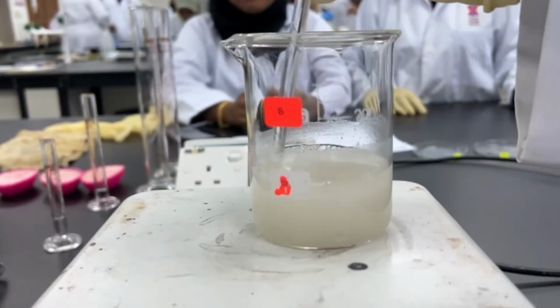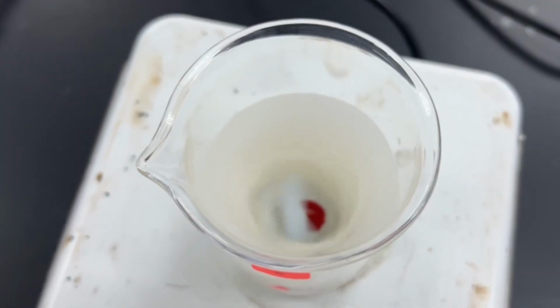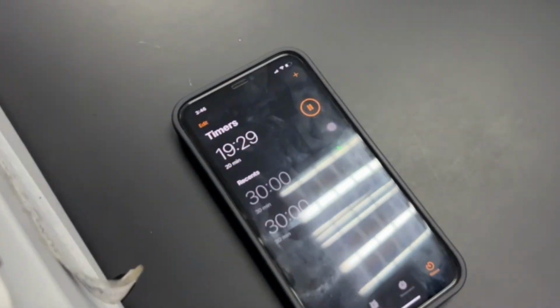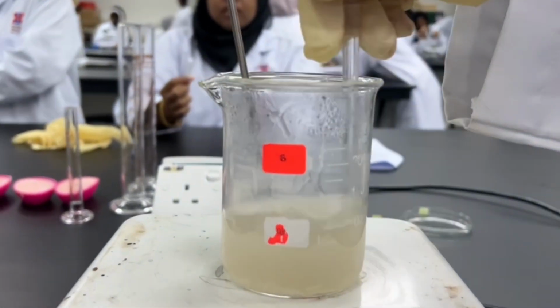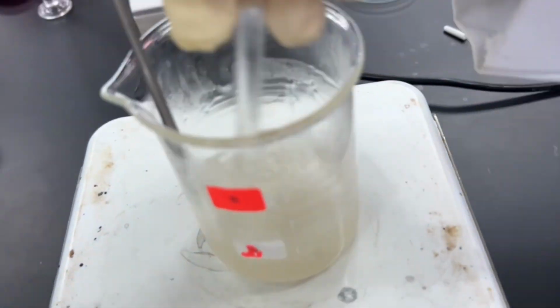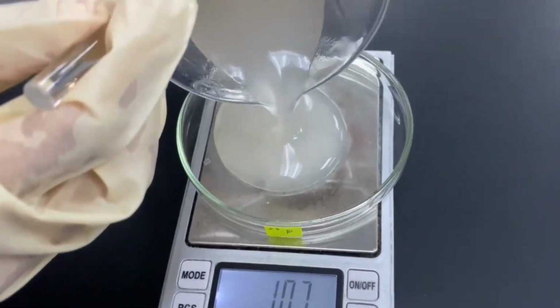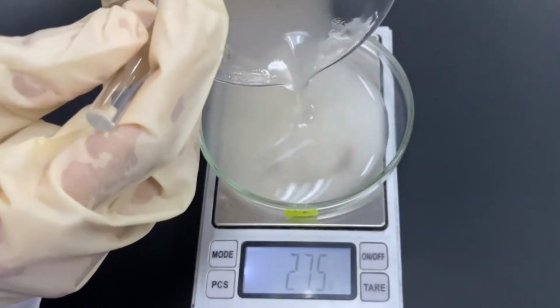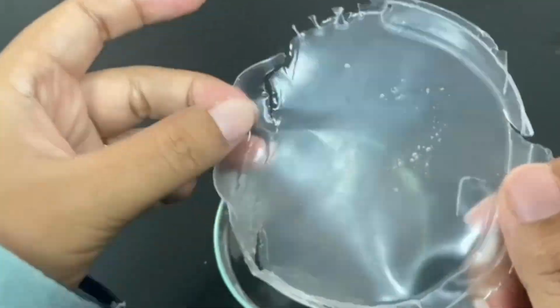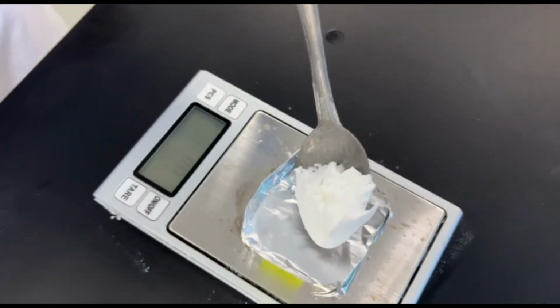Bring the beaker onto a hot plate, heat, and constantly stir with the metal stirrer. At the same time, a thermometer is used to monitor the temperature. When the mixture reaches 85 Celsius, continue heating for 20 minutes while constantly stirring. After that, add 15 ml of glycerol 5 minutes before the end of the 20 minutes. After 20 minutes, pour the solution into a petri dish until it reaches 45 grams on the digital scale. Then, for the final step, after 3 days of drying, the bioplastic is obtained. And last, to see the difference, all the steps were repeated using a commercial starch.